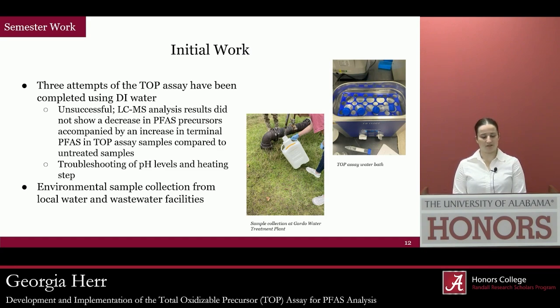In our second and third attempts, we have been troubleshooting, first with our pH levels by ensuring our pH remains high enough throughout the entire reaction for the reaction to fully occur, and also our heating step by ensuring that our water bath remains at the correct temperature the entire 6 hours. You can see in this image on the right some observation of our TOP assay samples in that water bath.